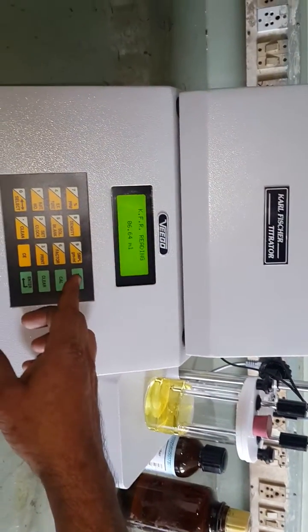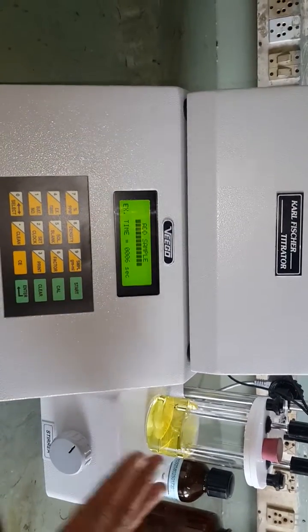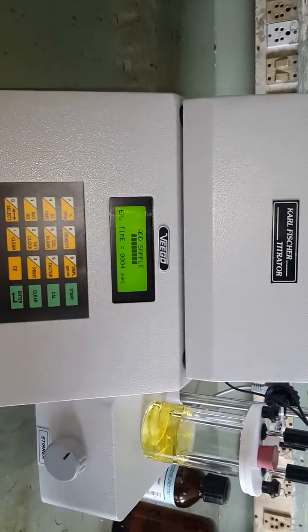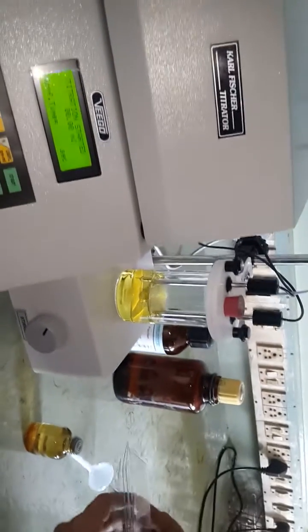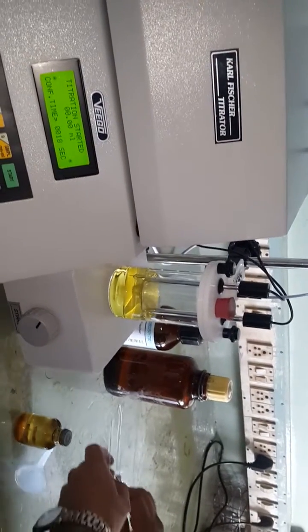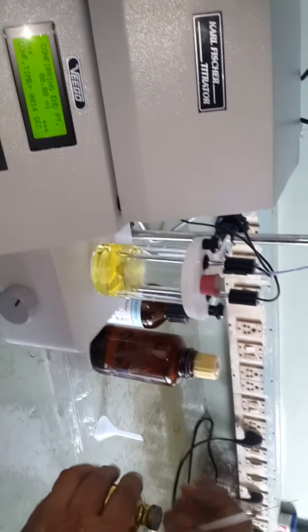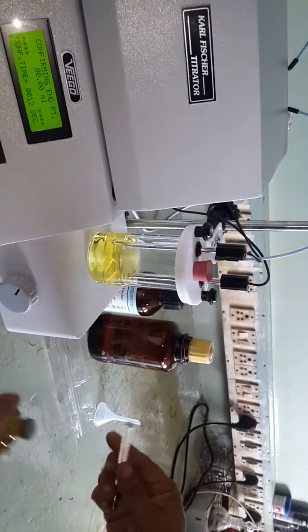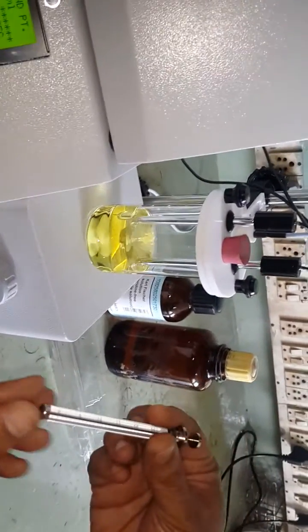Press the start key again. We have completed the first stage of the titration. Now we are in the second stage, where we determine the factor — that is, the strength of the Carl Fischer reagent. A 25 microliter syringe has been supplied for this purpose.